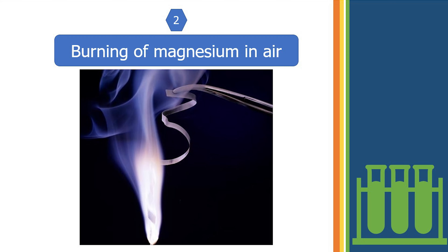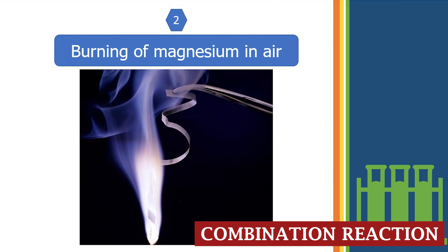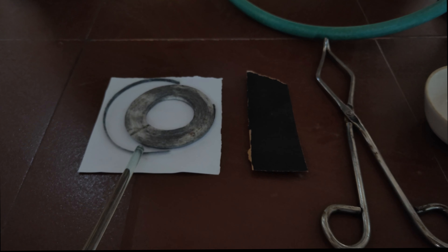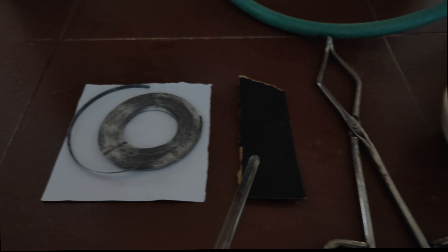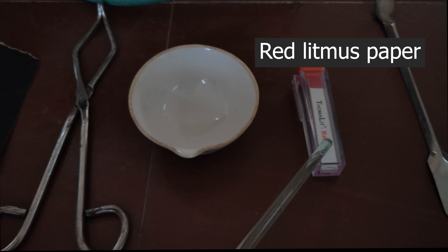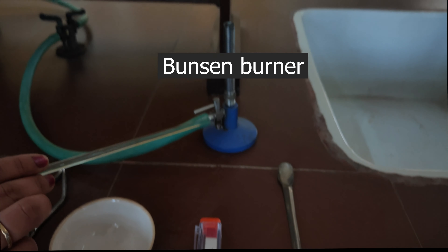The second experiment is burning of magnesium in air. Materials required: a small piece of magnesium ribbon, sandpaper, tongs, china dish, red litmus paper, and Bunsen burner.